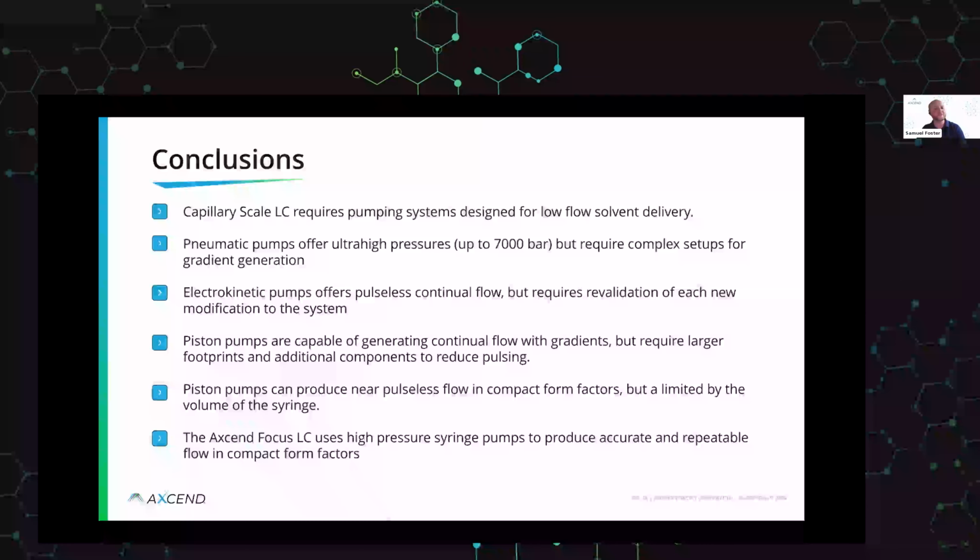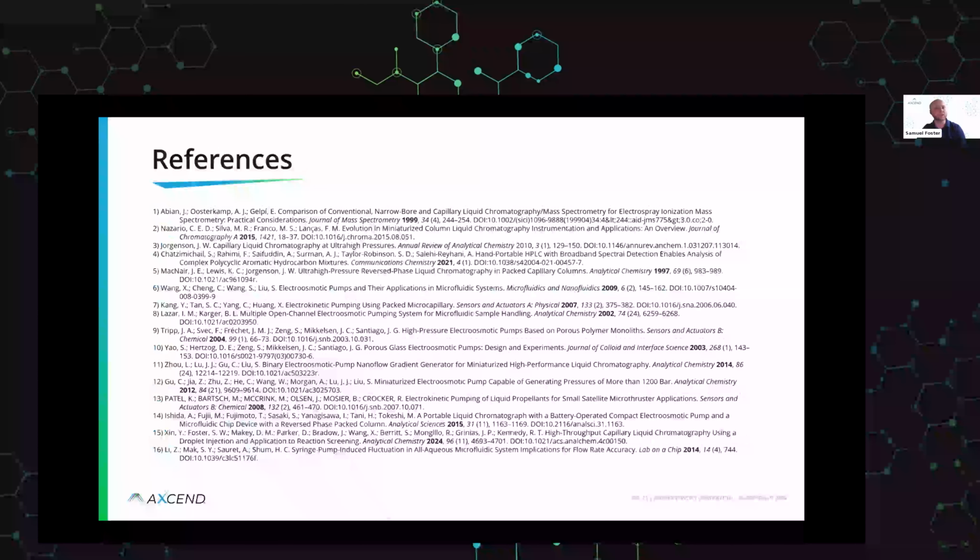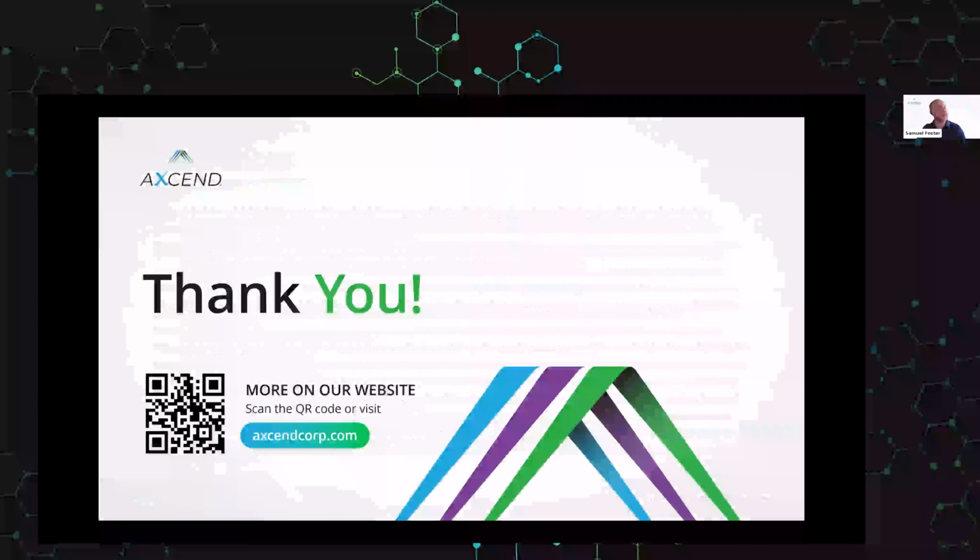The Axcend Focus LC uses these high pressure syringe pumps, and we're able to produce accurate and repeatable flow in these compact form factors. And so that's sort of a brief overview of the different solvent delivery methods that are available today. Here are my sources, and thank you.